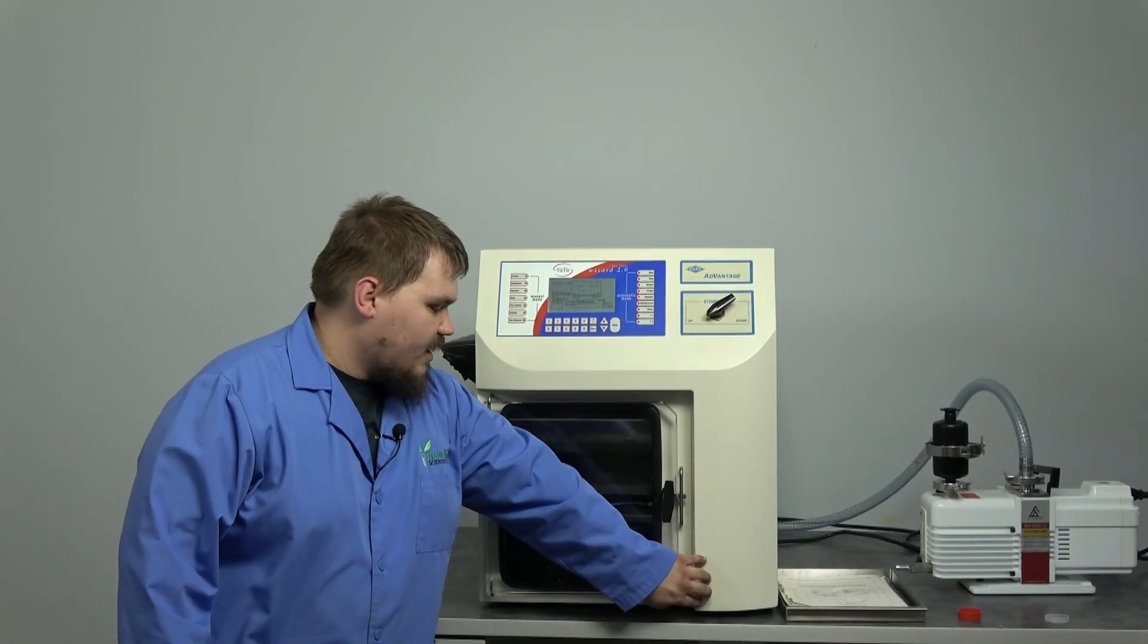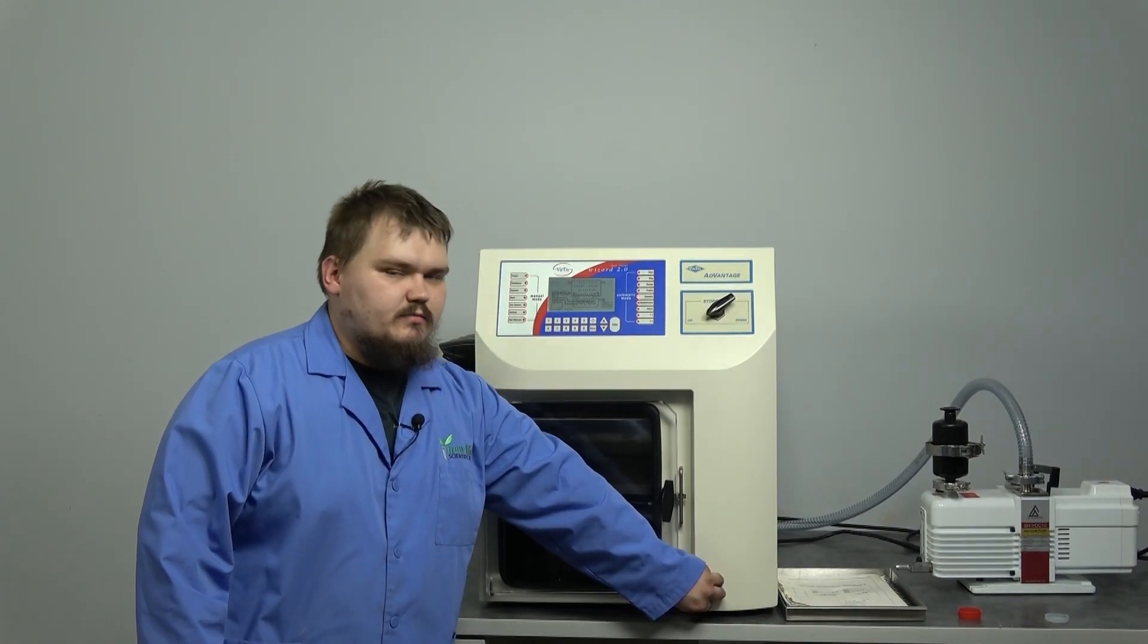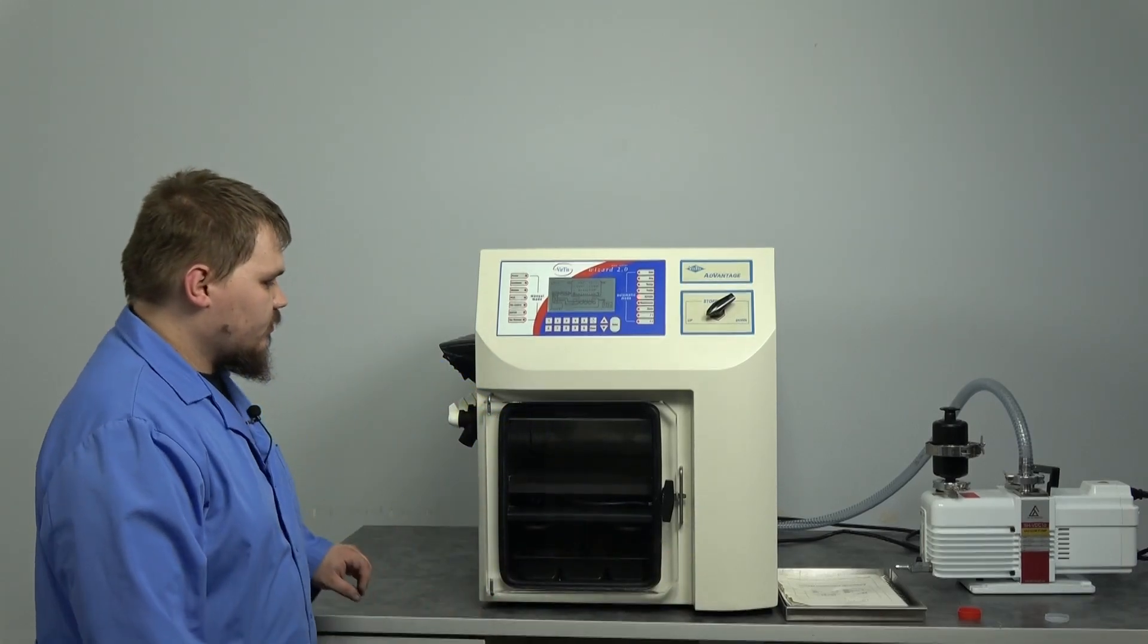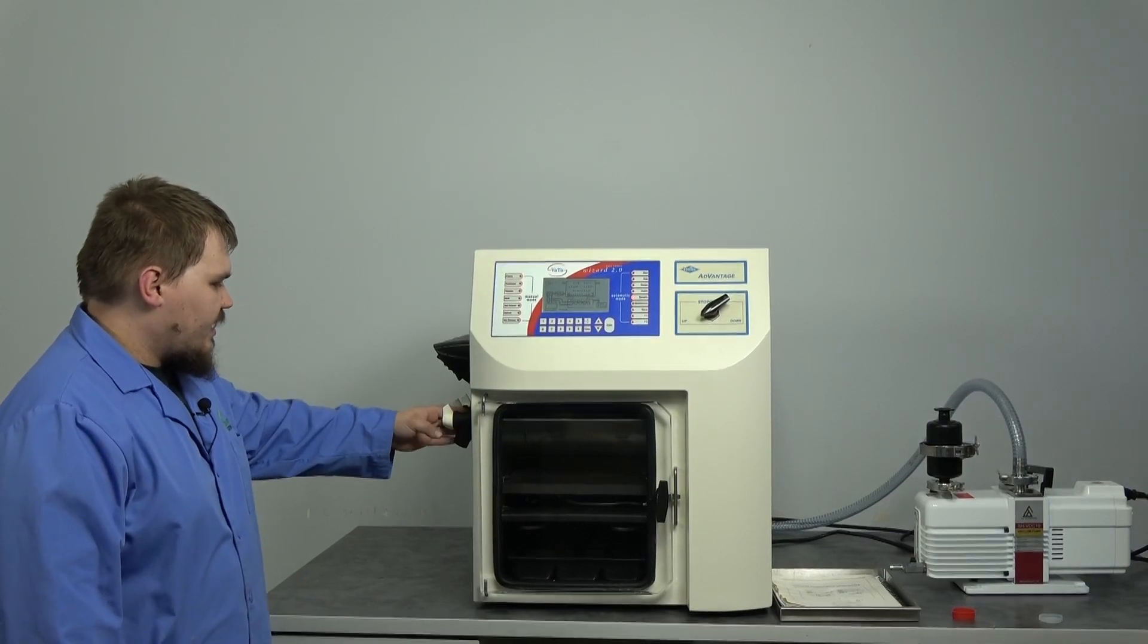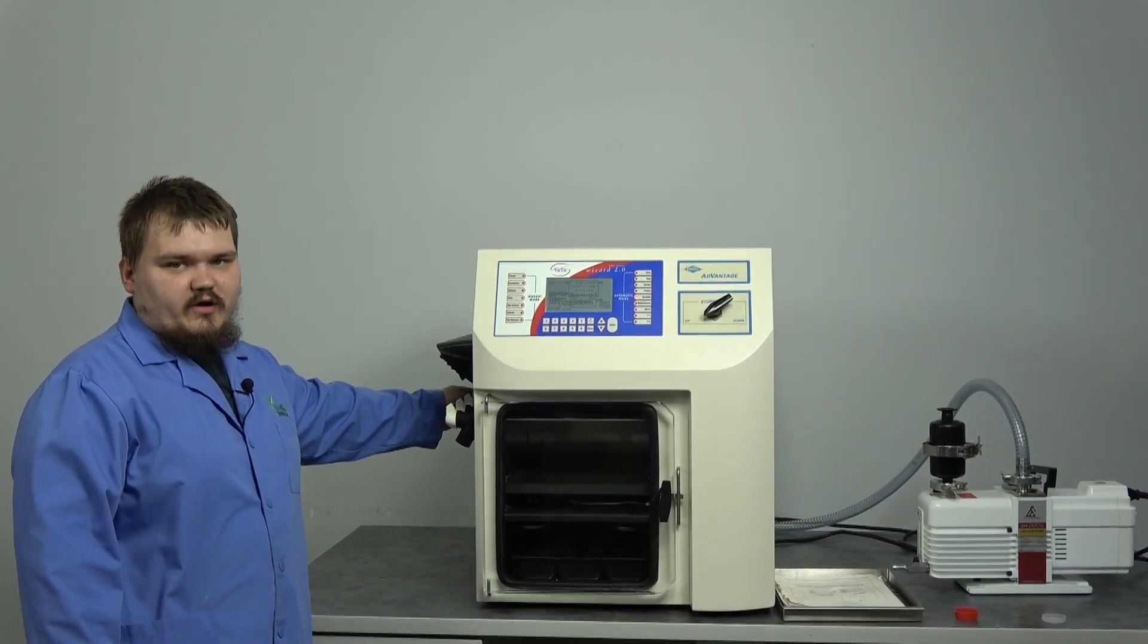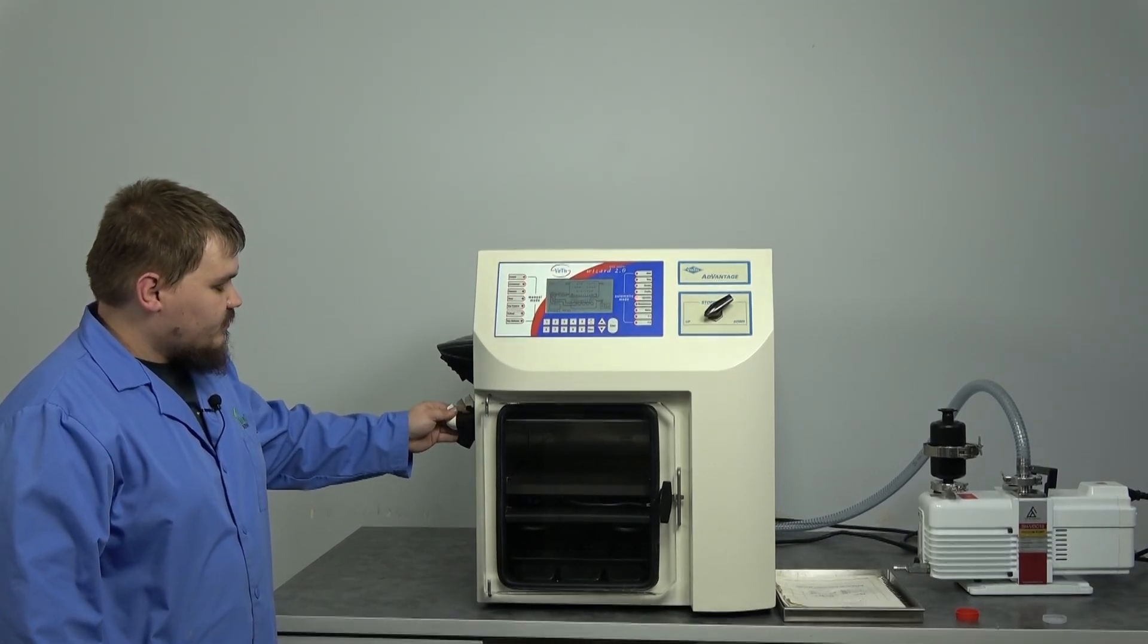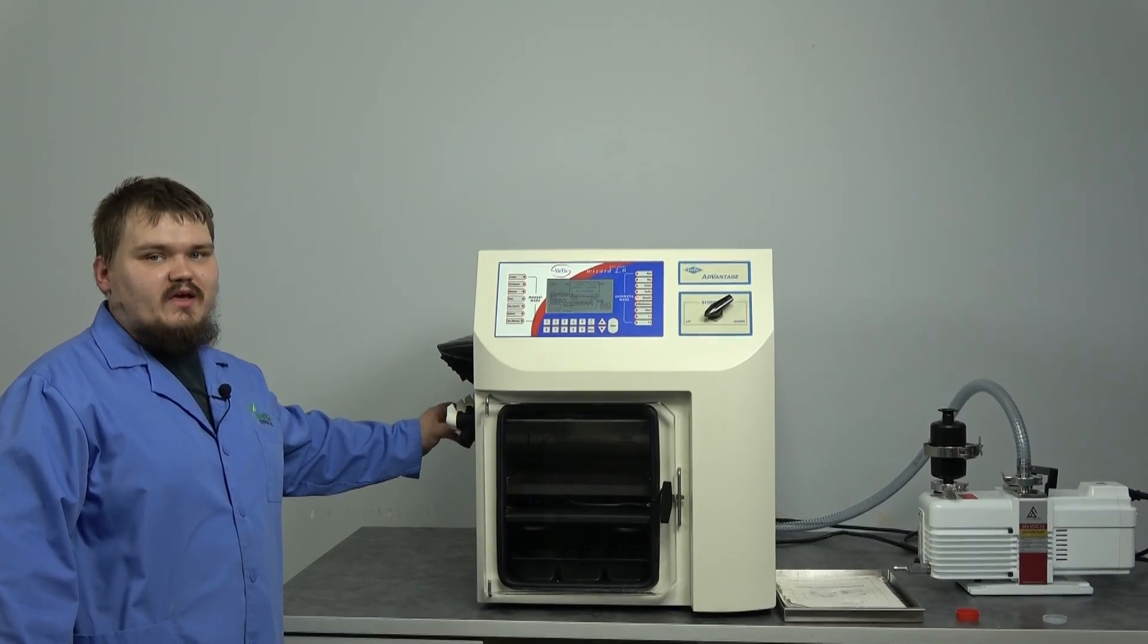Some of these machines did have a condenser drain that sat right here. This machine does not come with one at all, so we're not going to worry about that today. The machine does have four vacuum valves right here that we want to make sure are in the off position for later when we test the vacuum.